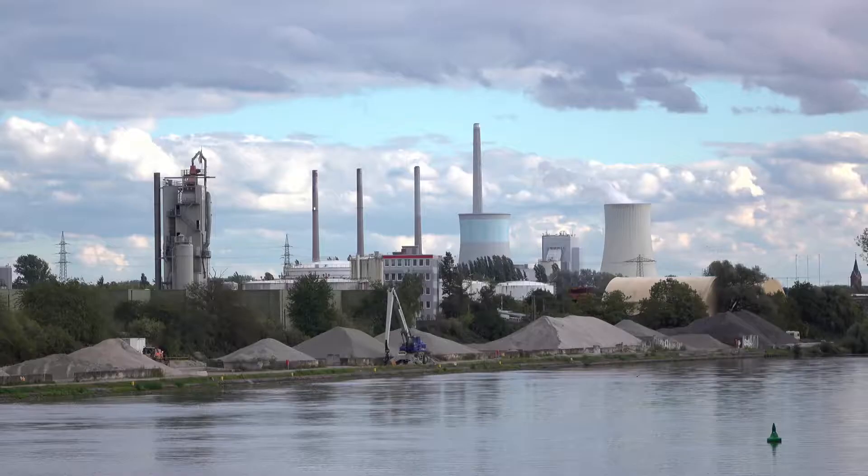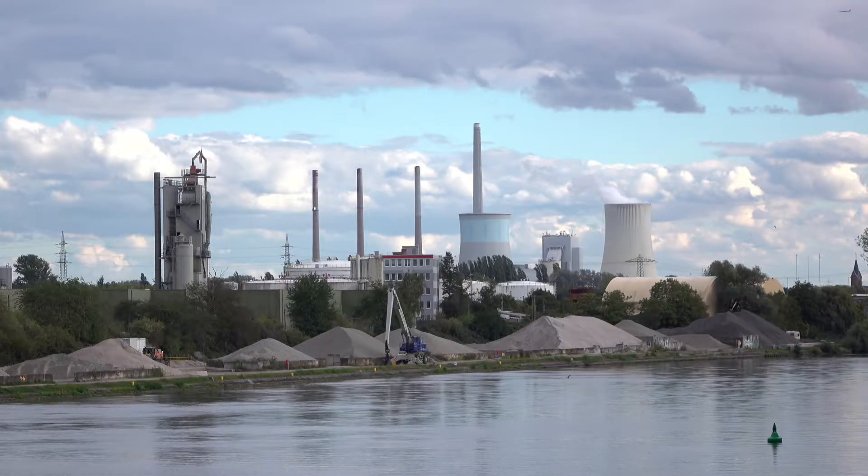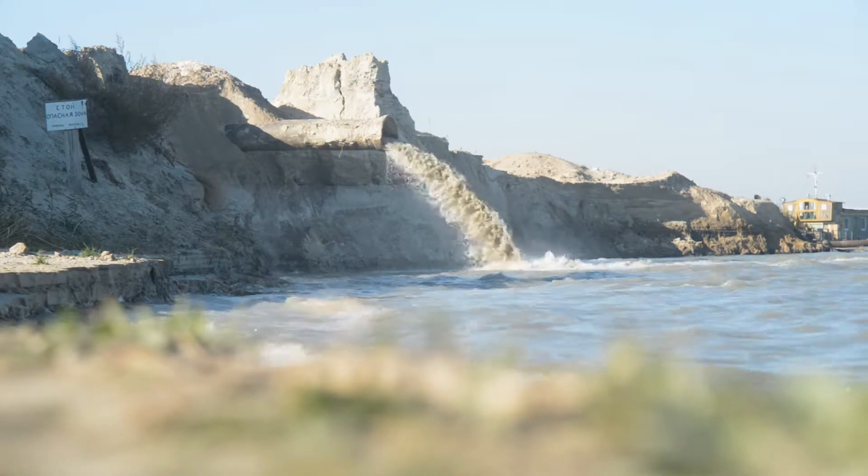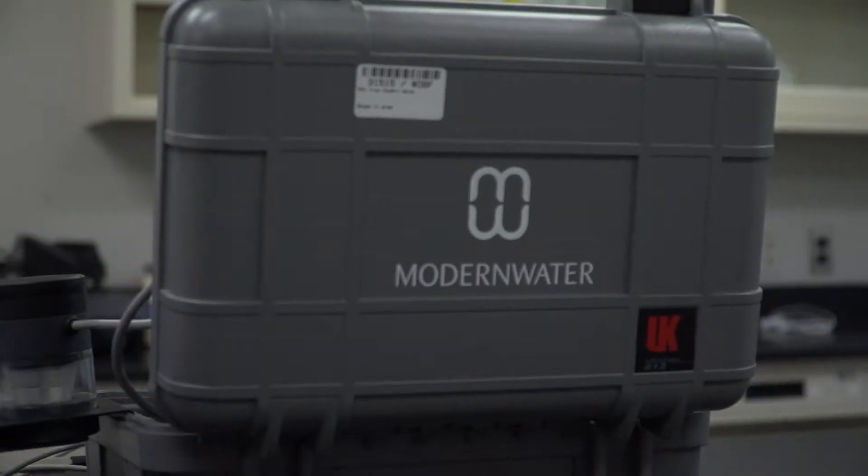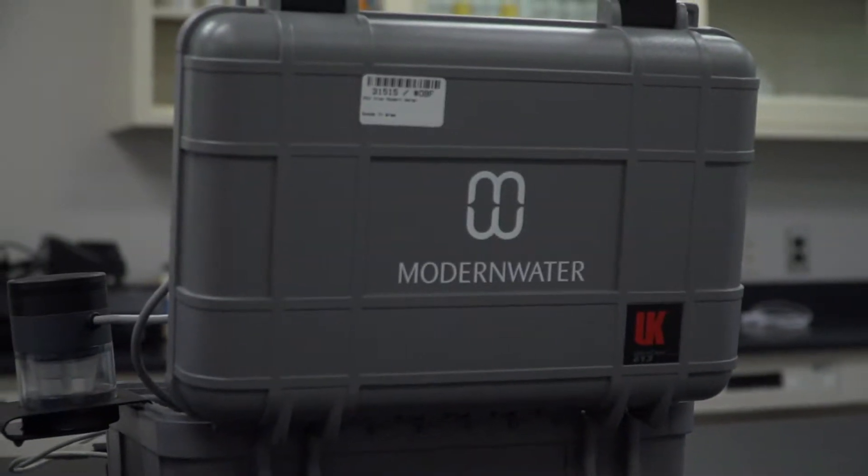The Microtrace PDV provides excellent on-site characterization of pollution hotspots and contamination sources. It is fully portable, enabling its use as a standard laboratory instrument, a field screening device, or a combination of the two.